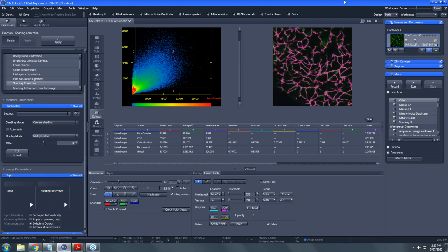Oh, there was also the fact that we wanted to do a subset of the image. Right now we're analyzing the entire image that is above the threshold, but if we had a tissue section where some portion of the tissue was, let's say, cancer and some portion was wild type, then we wouldn't want to analyze the whole thing simultaneously. So it is possible to manually isolate regions of the image.